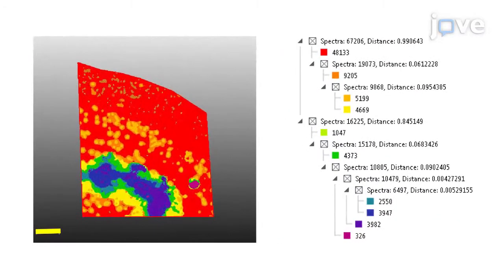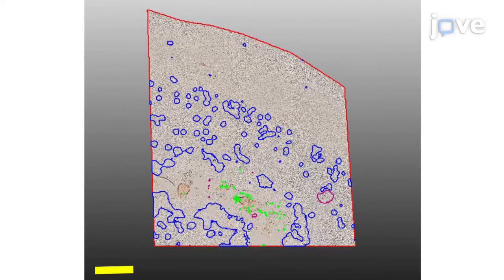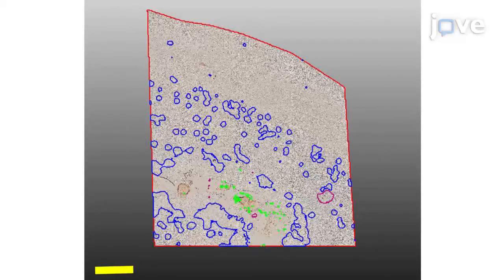Shown here is a segmentation map obtained with a bisecting K-means analysis applied to the same section from patient number 3. This clustering method successfully identified plaque-like structures in the parenchyma and vascular structures in the subarachnoid space. It is interesting to find a small circular area in the parenchyma which is detected just around a small arteriole in the parenchyma as well as in the subarachnoid space.